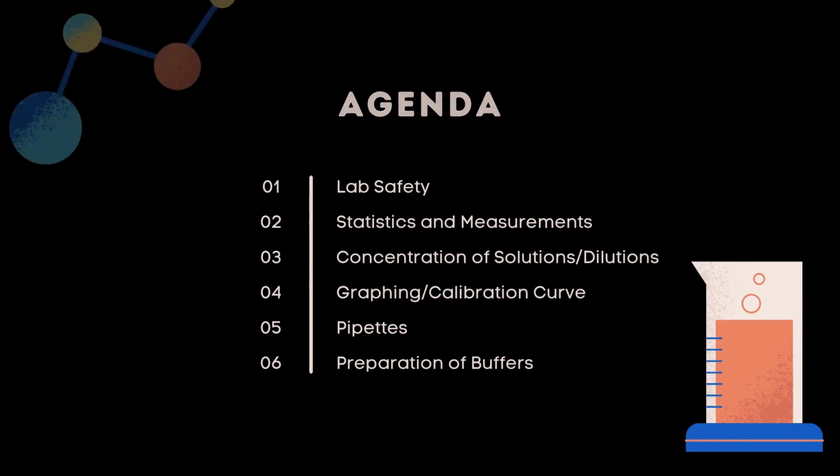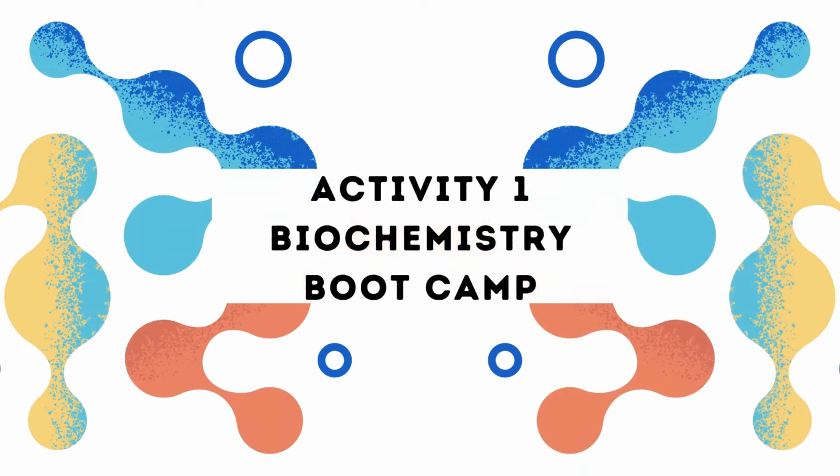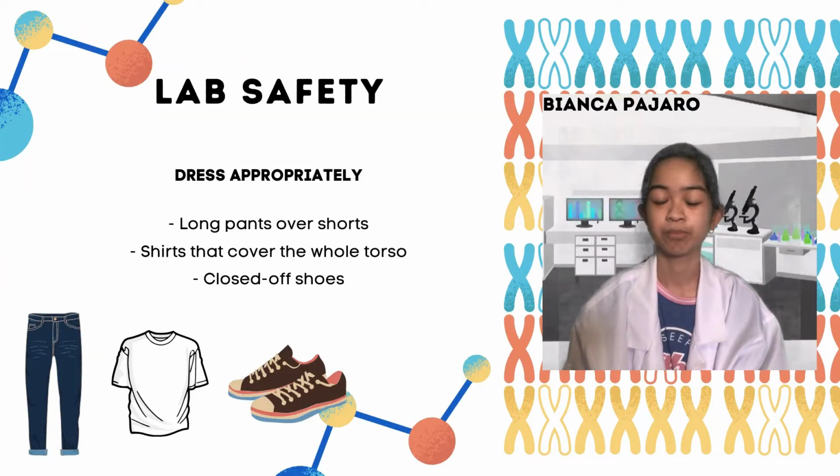Today, my groupmates and I will be talking about a few things. But first, let us talk about the do's and don'ts in a laboratory. First off, we should dress appropriately.